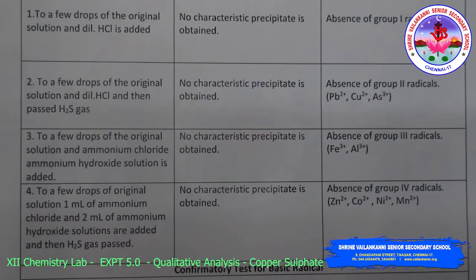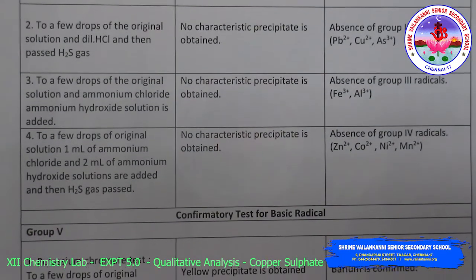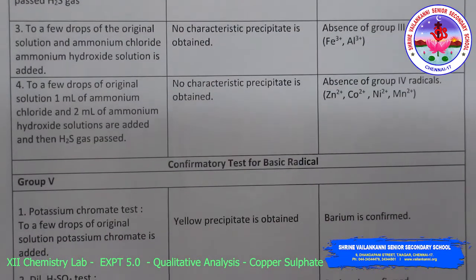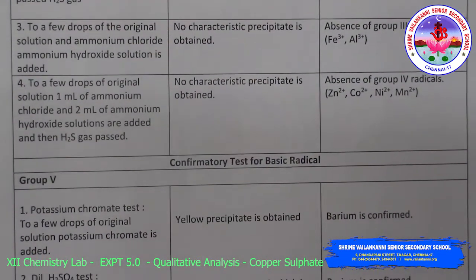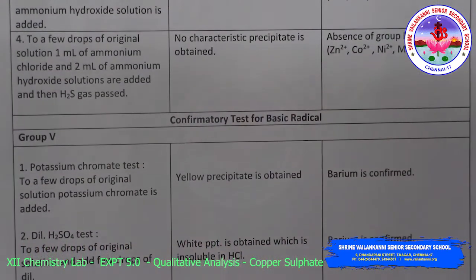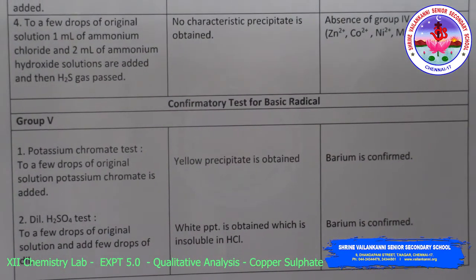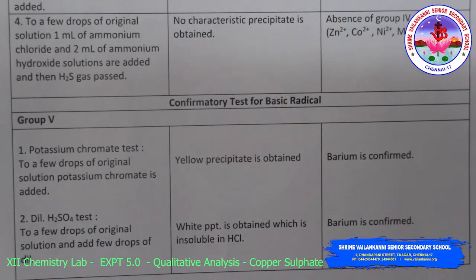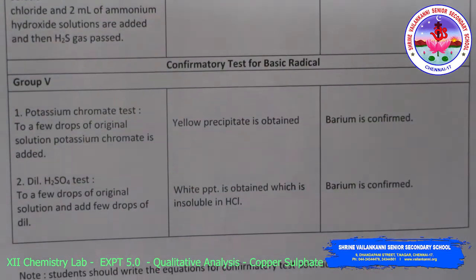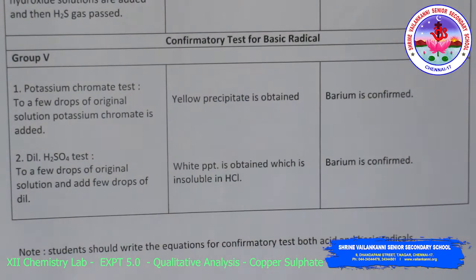Then to a few drops of original solution, add ammonium chloride and ammonium hydroxide solution. No characteristic precipitate, so group 3 radicals are absent. Then to a few drops of original solution, add 1 ml of ammonium chloride and ammonium hydroxide solution and pass H2S gas. No characteristic precipitate, so zinc, cobalt, nickel and manganese are absent, that is, group 4 radicals are absent.